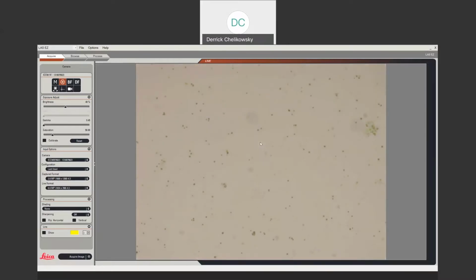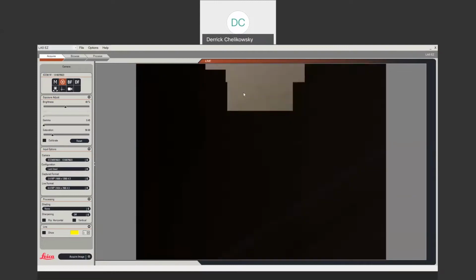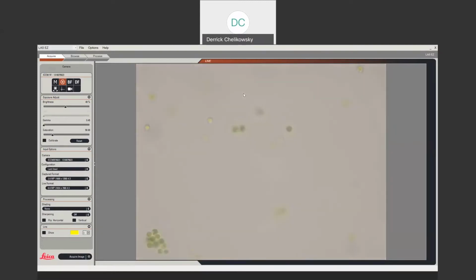Now, you notice that there are several planes here. This is because this is a wet mount. And when we have wet mounts, we have water, and water tends to create multiple planes. Let me see if I can increase our light going through the microscope a bit. There we go. Now let's zoom in a bit. Aha. Here's some of our Chlamydomonas. Let's see if we can go get us some cells to look at. There we go.